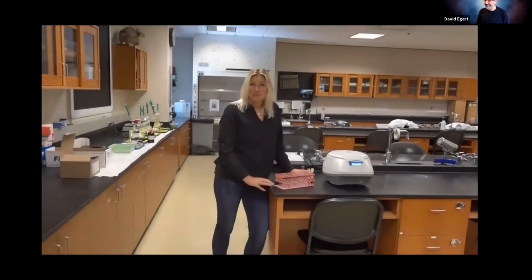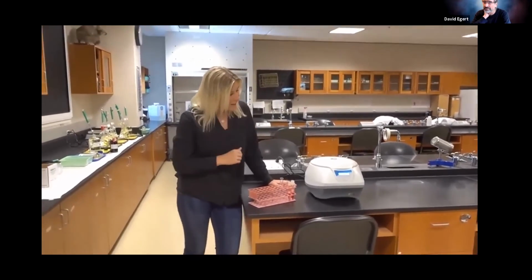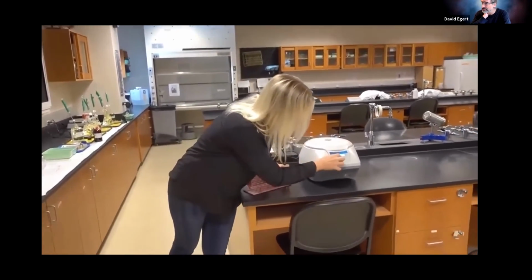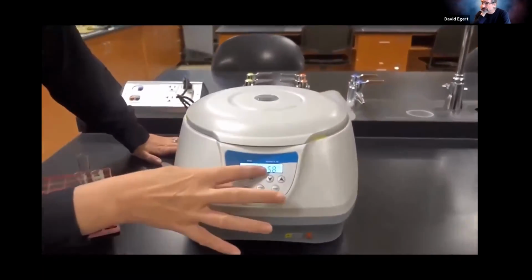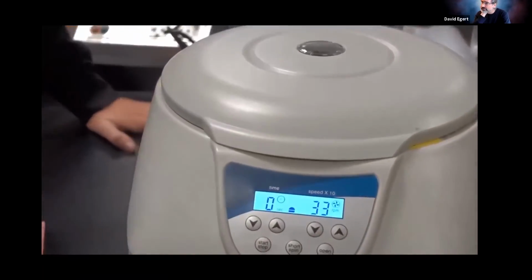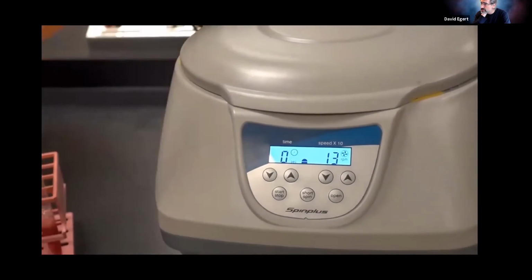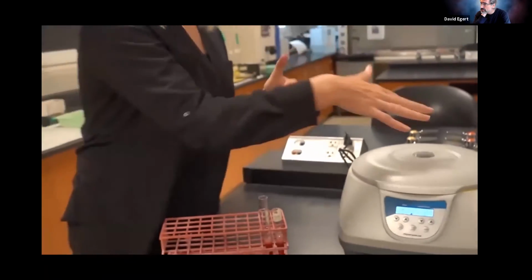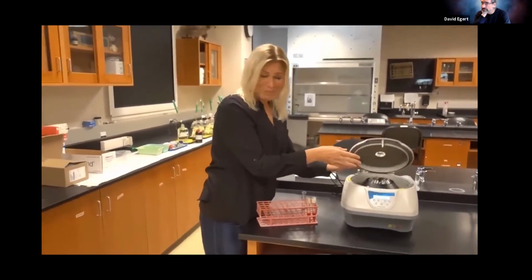All right, so the centrifuge has just finished. I can hear it slow down, and you can also see on the numbers that it's slowing down right now. It says 62, 58 RPM. The lid probably won't open until it's completely still, because you don't want to lose any fingers. There we go. It's also giving a nice little beep.